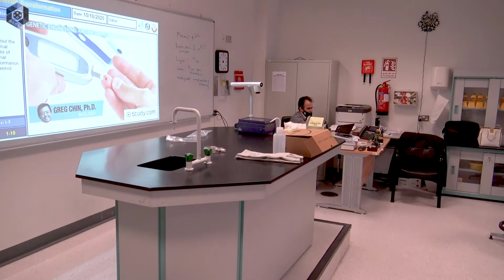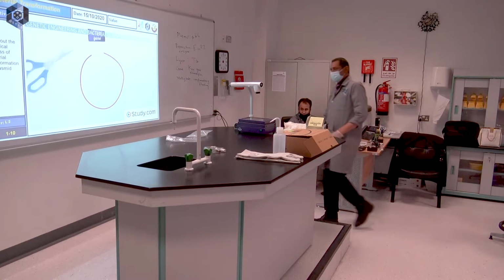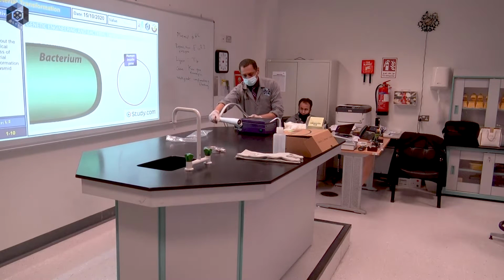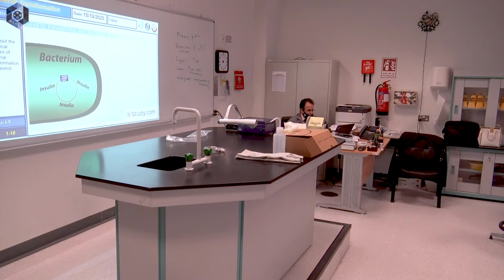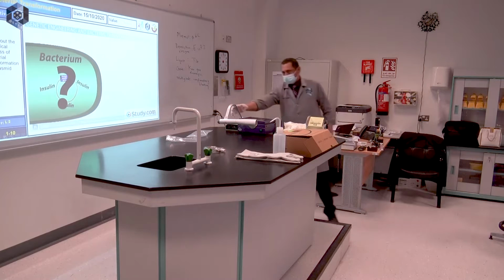Of creating human insulin for diabetic patients. To this point, our efforts have been focused on creating a recombinant DNA plasmid that will be able to express human insulin. But, if you recall, our ultimate plan is to get bacterial cells to make insulin. That means we need to get our human insulin plasmid into a bacterial cell. Is that even feasible?